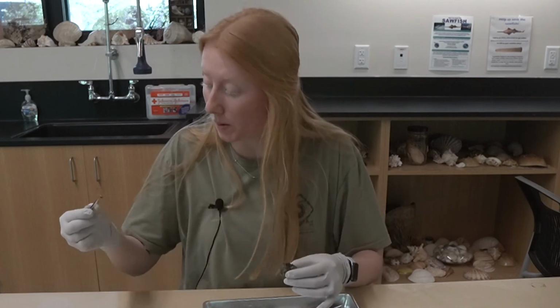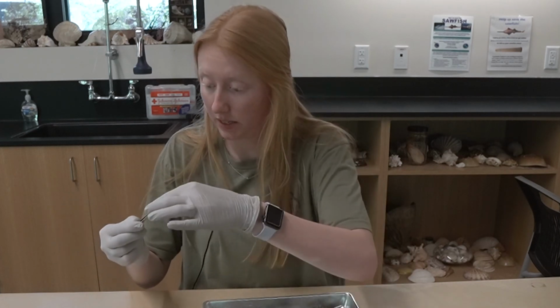Another pretty big leg bone, so it looks like. Probably hind leg. Let me clean it off just a little bit more.